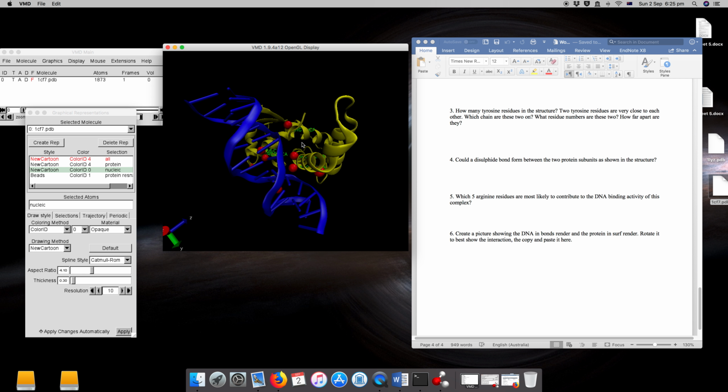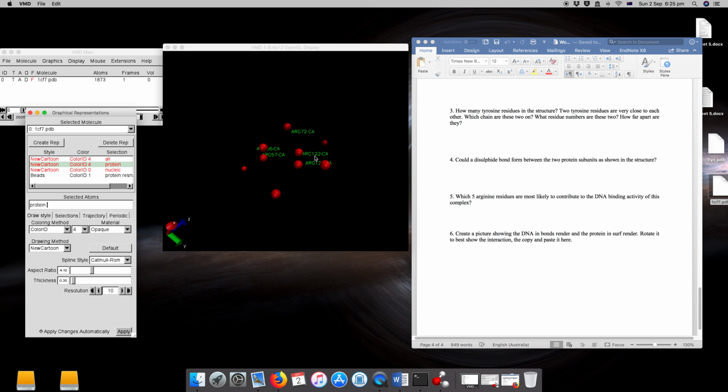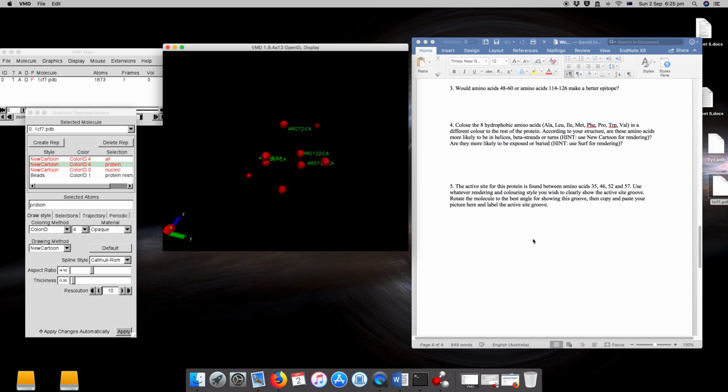So in order for you to see them, I'll just deactivate all of these. So it's arginine 72, arginine 122, and arginine 121, arginine 57, and arginine 56. So there you have it. We have answered all these questions using VMD.